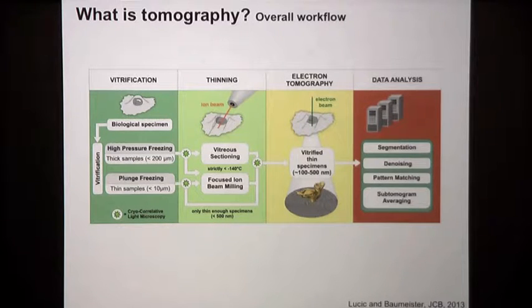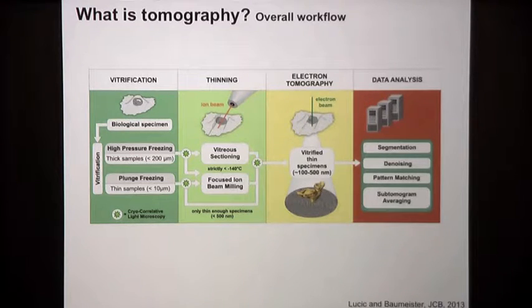Tomography is associated with the same problems of sample preparation, data collection, and data analysis. And this is the challenge that I have with this lecture, to go through all these steps in one lecture. So hopefully by the end of this lecture, you'll have an overview of what's involved in going from a sample to a final high-resolution structure from your tomography data, if you so require.